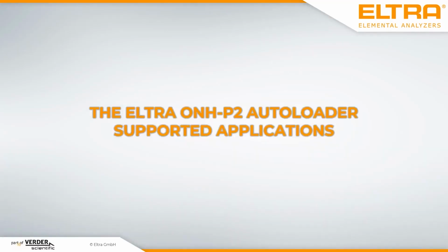When you are listening to this webinar and see maybe how it works, how automated analysis works in general, you maybe ask yourself, is this suitable for my samples, and can I process my samples with the autoloader? And this is something I will discuss on the next slide, because automated ONH analysis could mean something different in comparison to manual analysis.